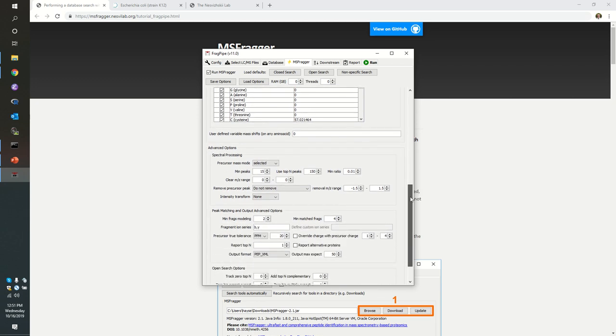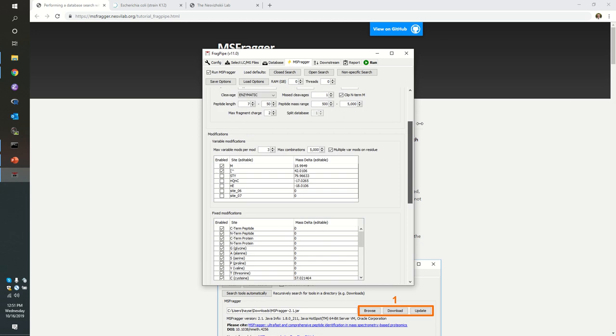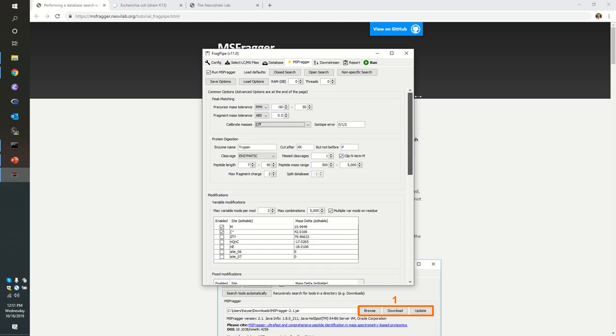But I would point out that this same interface is here to enable you to do open search. So if you want to go that direction, you can. But I would strongly suggest you do it on a desktop computer with a lot of RAM, because it'll go faster.